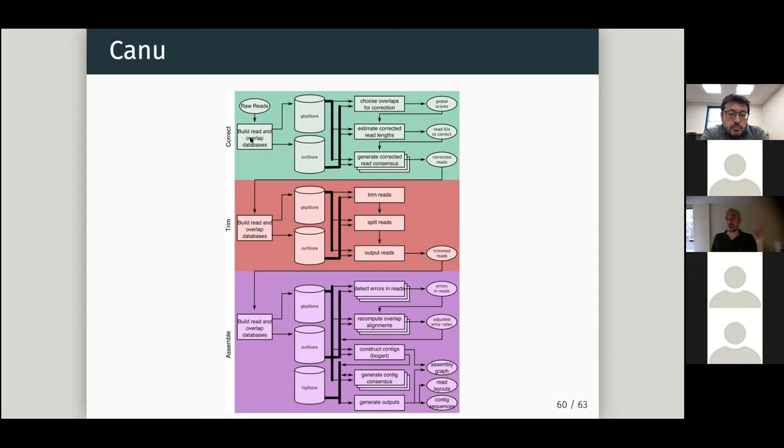So I'm going to just remove them. I'm going to turn all the sequences that have these errors, remove the error, and put there the most common sequence that I find based on the alignment. Of course, this is an error-prone process because you could potentially correct things you shouldn't correct, but at least you end up with corrected reads, and corrected reads are then used.